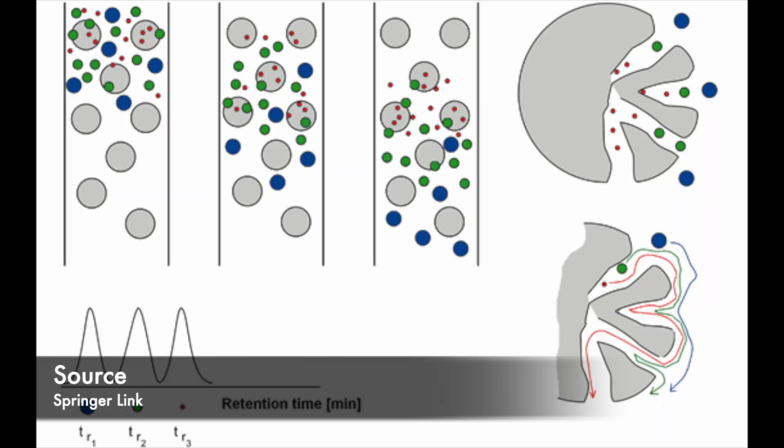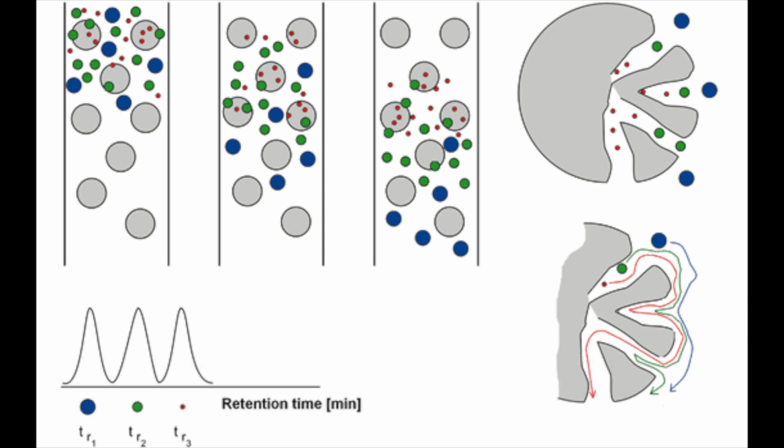We're looking here, this image, we're looking at the size exclusion chromatography column. You can see it's filled with these porous beads, which are of a very random size, what size these pores are in the beads, but you can buy columns with different size limits. And in this case, basically the whole point here is that if you have something that's smaller, it's going to be able to fit inside the cracks of these beads, and it's going to kind of get stuck in there, just like aimlessly wandering around.